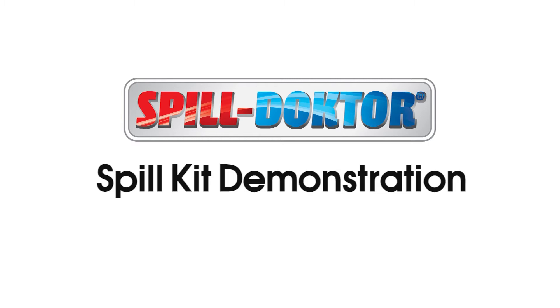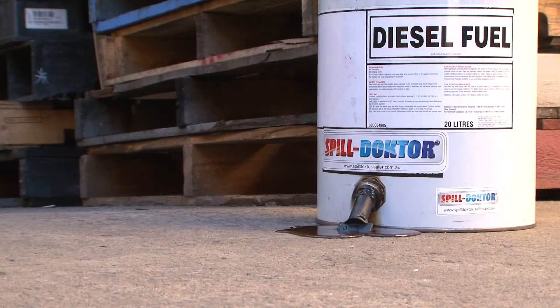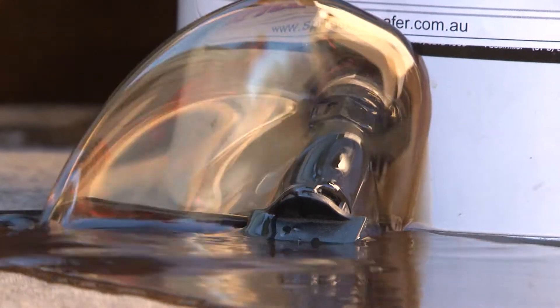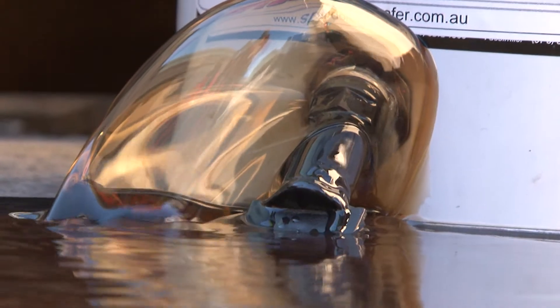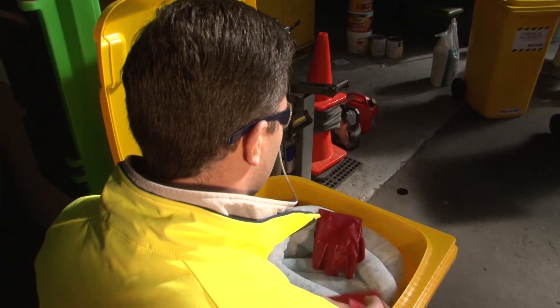Spill kit demonstration. When a spill occurs, ensure your own safety first.